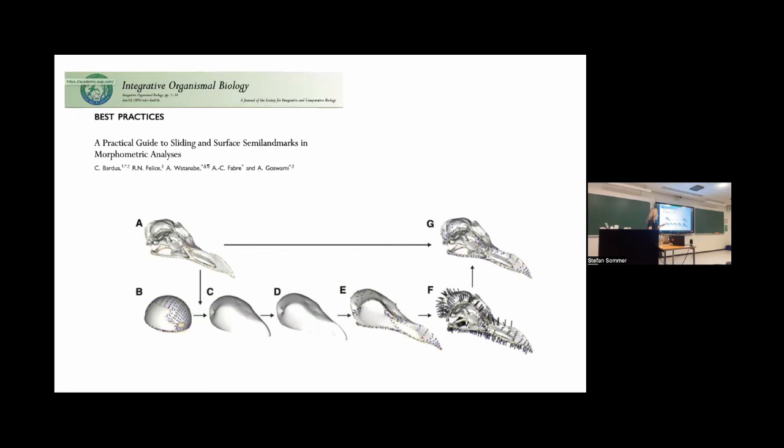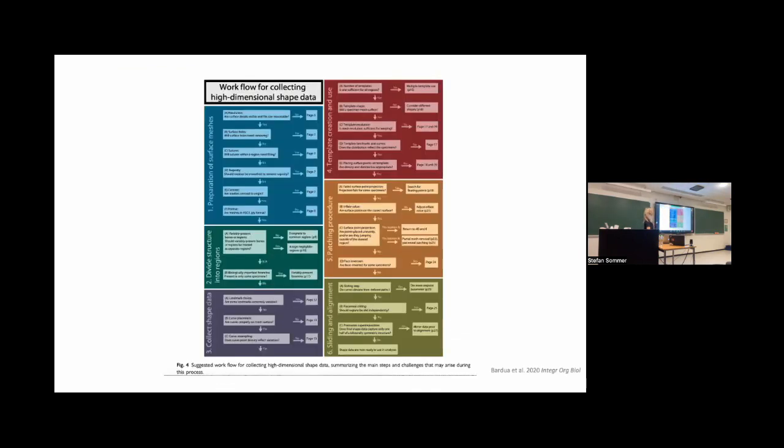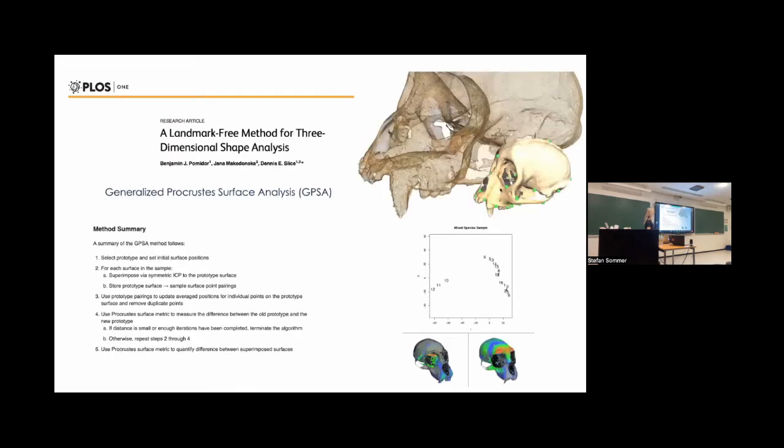Oh, and I'll just go through this quickly, let's have things like Anjali's method baked into the system. She's given a list of everything we need, workflows, it's there. We don't only have to do landmarks, right? We can do what Doug talked about yesterday, non-landmark approaches that are semi-automated, and there's other ones as well.